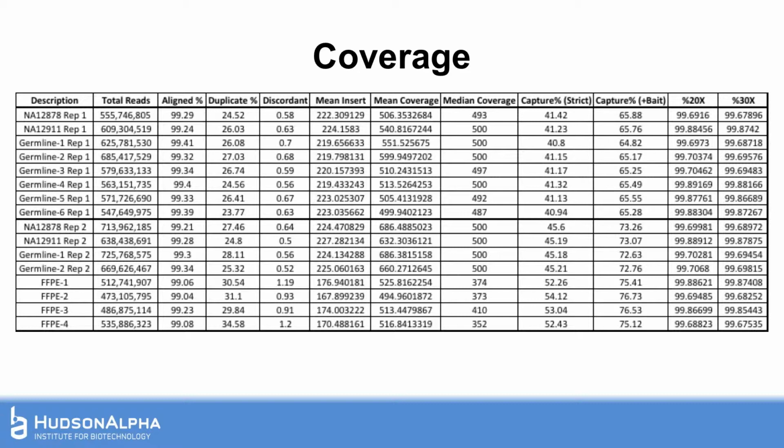So clearly we were seeing a highly complex library that captured quite efficiently. And so we're actually, frankly, very surprised at the complexity of the library and the ability to sequence while maintaining a very reasonable duplication rate percentage all the way out to 500x coverage.